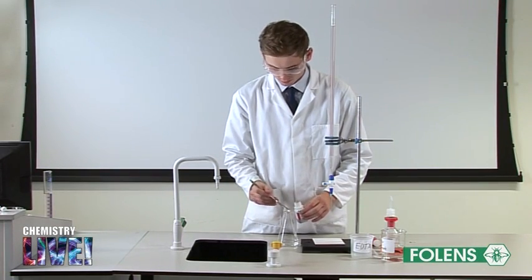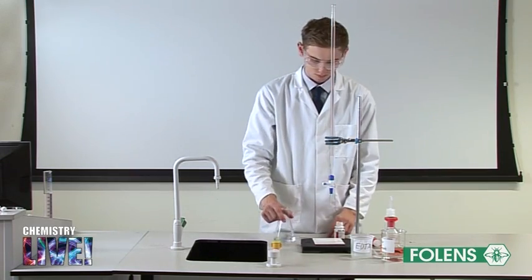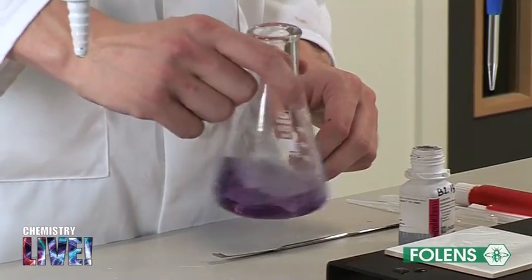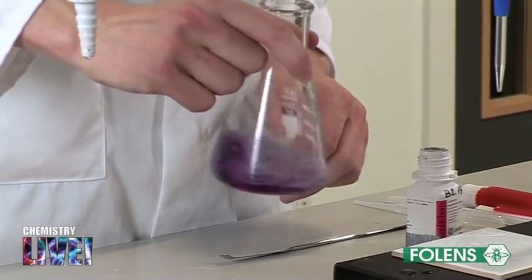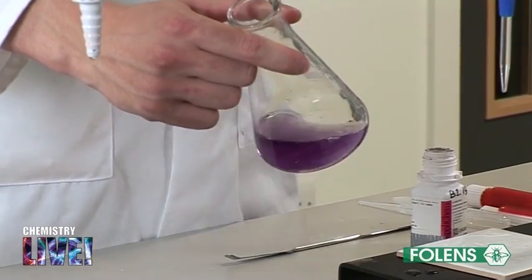In this titration we use a buffer solution to keep the pH around 10 as the indicator works best around this pH. This will help to give us an accurate endpoint in the titration.